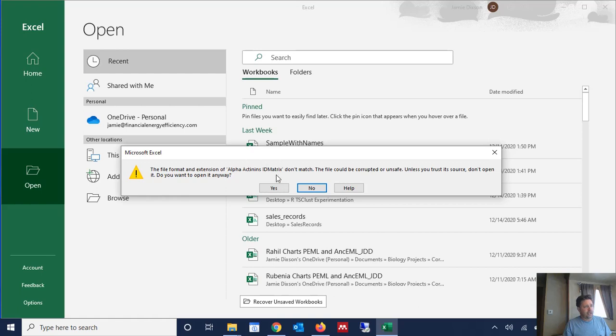And it's now asking me if I trust this source because it doesn't recognize the file format. And we're going to say yes we do. We want to open it anyway.